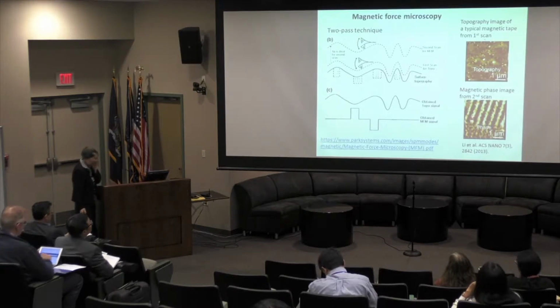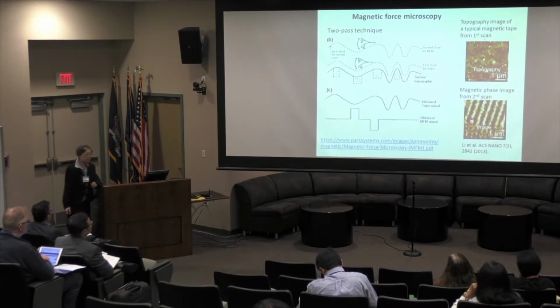So originally, we thought we would use this so-called MOKE, or SMOKE, which was developed in the 80s, called surface magneto-optical Kerr effect, where you shine a polarized light onto the sample of interest and monitor the change of polarization of the reflected light.